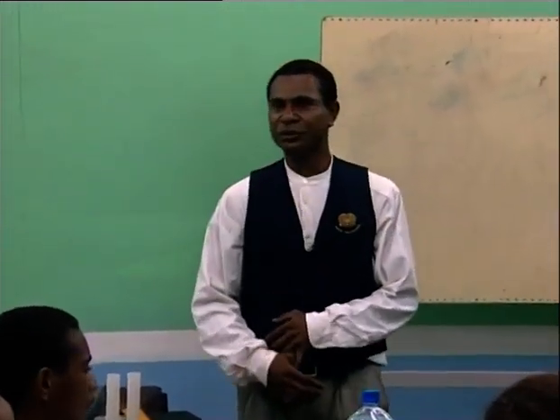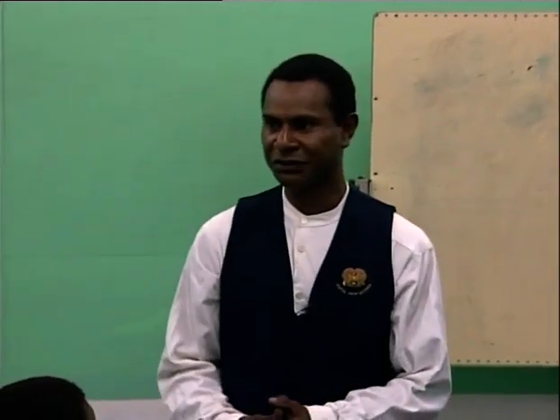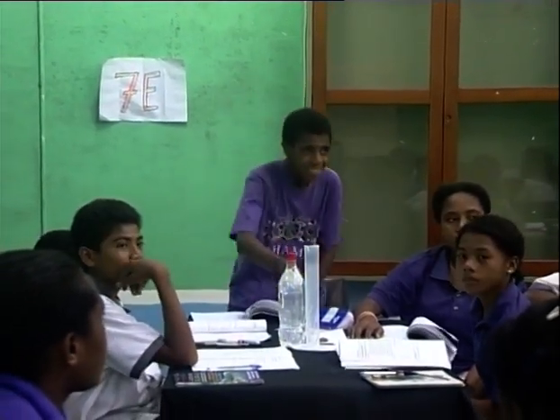So in this lesson, which of the two units do you think we'll be using? Walter? Measuring cylinder. Thank you. The instrument is the measuring cylinder. What is the unit? Alan? Milliliter. Okay, milliliter.